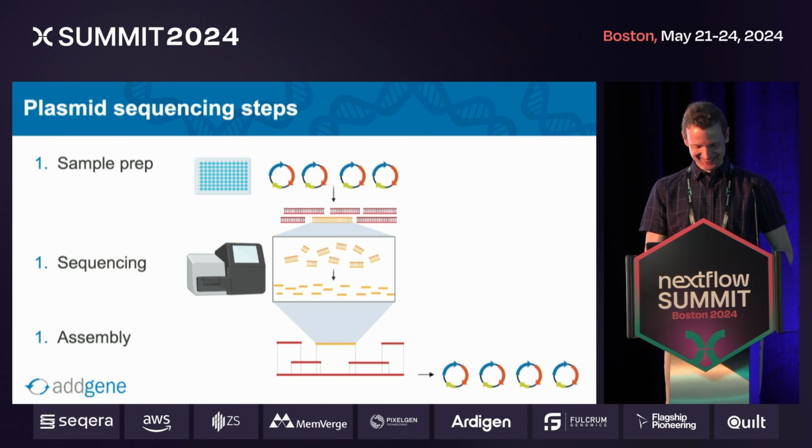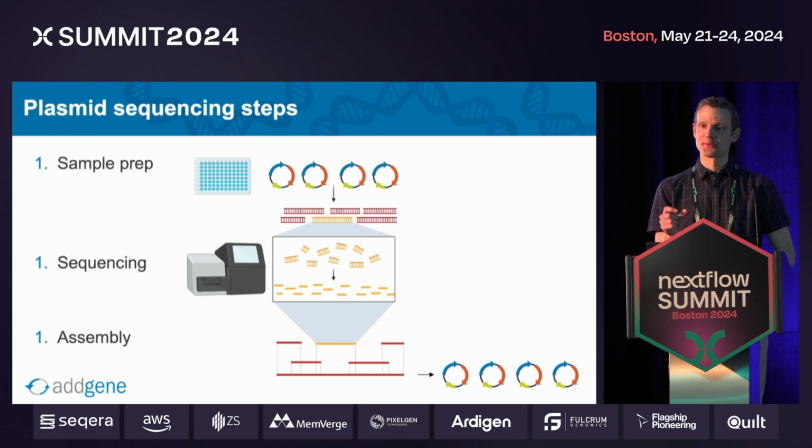We then put that on our sequencing instrument, and then that reads the DNA sequence for those tiny fragments, including the barcode, and then we're able to tell which of those fragments came from which original sample. And so this kind of short read sequencing, it's nothing new, but the challenge for plasmids is that they're circular in structure, and they can contain a lot of repeats that can make the assembly part a challenge, because we have to be able to have sufficient overlap from all of those fragments to be able to recapitulate the entire sequence.